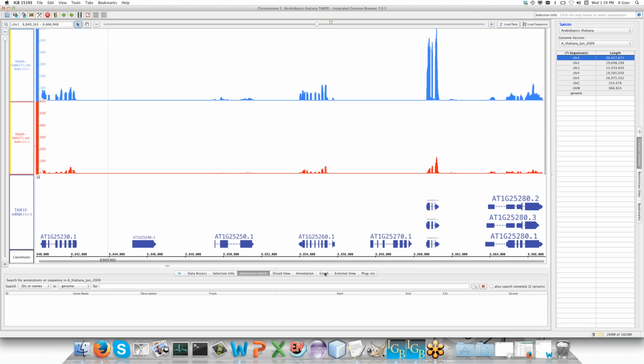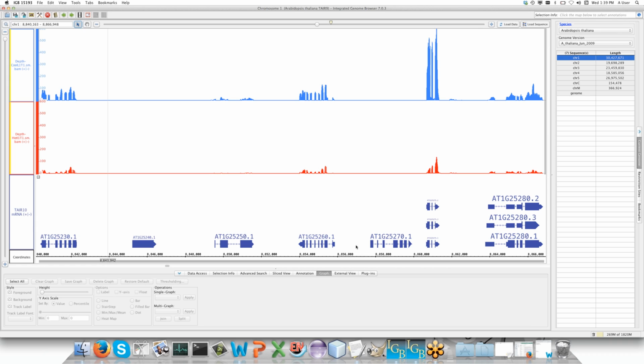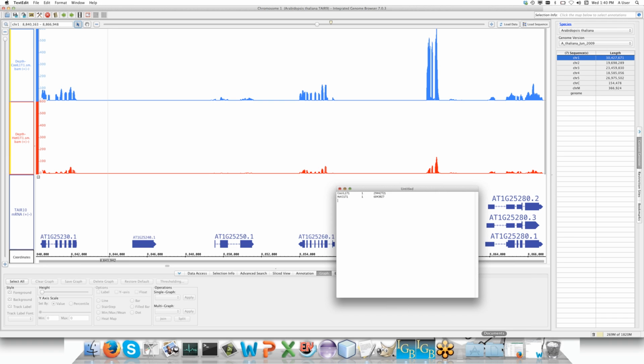So once again, this is that same region we were looking at, and this is a different experiment where we're using a control and a heat treated. Now, if you just look at the graphs, you can see I set them to exactly the same scale. And yet, even on the same scale, every single gene, the hot track shows cooler. But there's a reason for that.